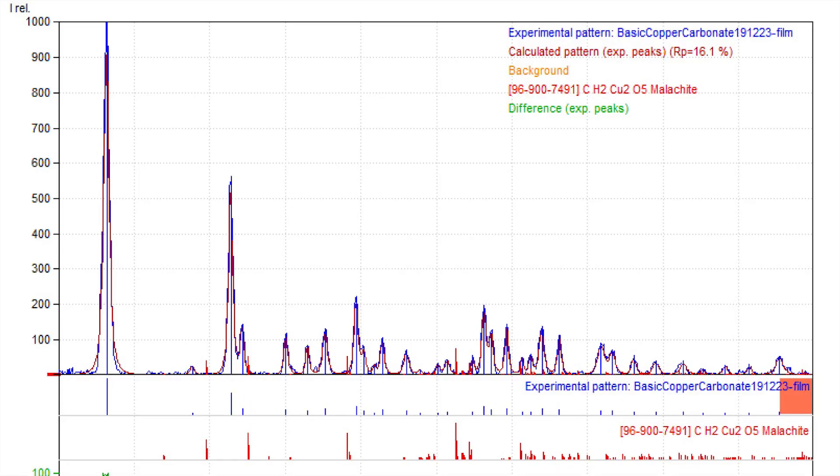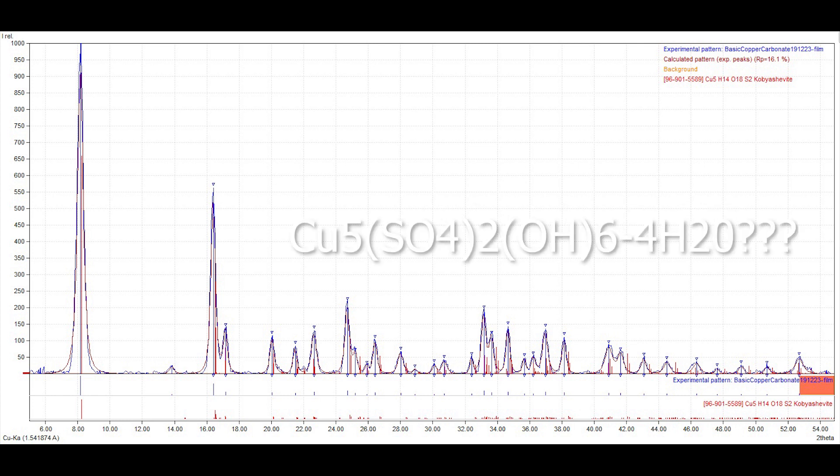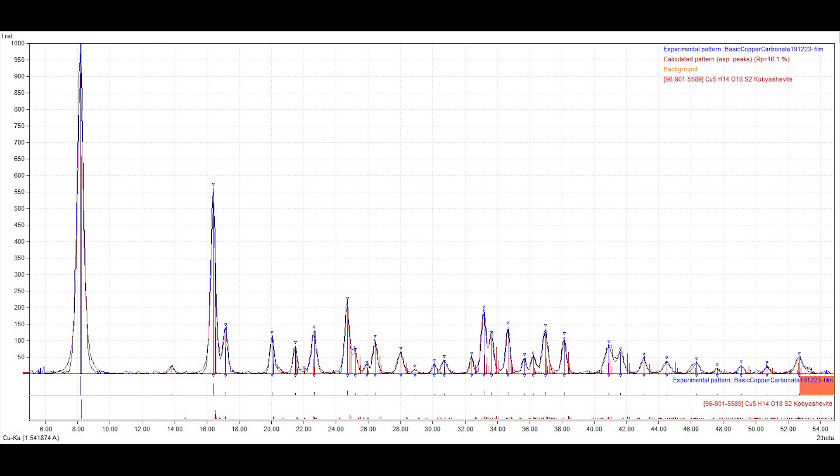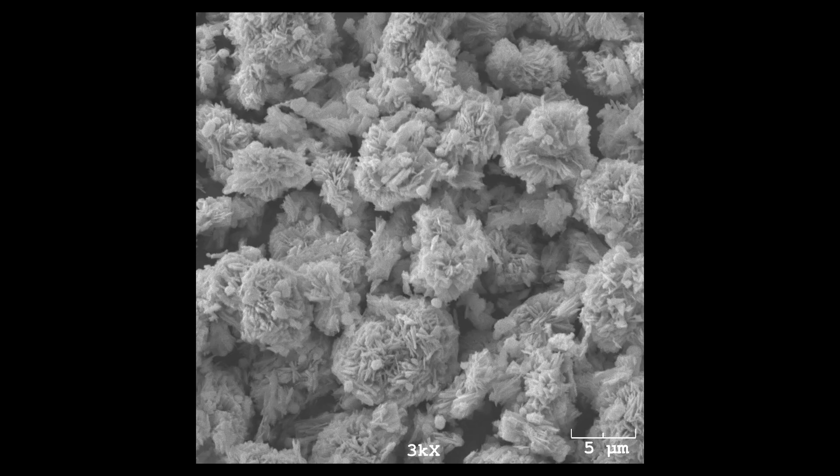It was at this point that I noticed things went horribly wrong. Looking at the X-ray diffraction pattern, the top in blue is what the sample is, and below it in red is what copper carbonate should look like — none of those peaks match up. When I search the database for the best match, I get this compound I've never heard of before, but it's a reasonable match — it's a sulfate. To confirm, I did an additional energy dispersive X-ray analysis for elemental composition and I can see copper, sulfur, and oxygen, so I have some kind of sulfate.